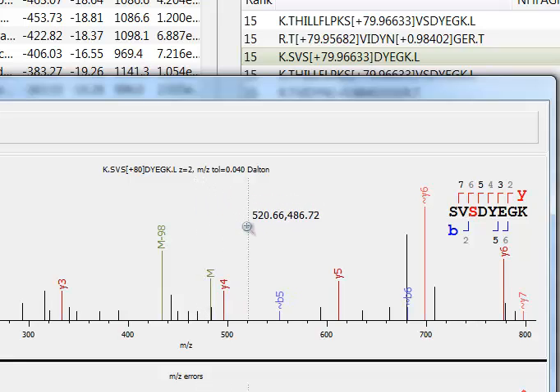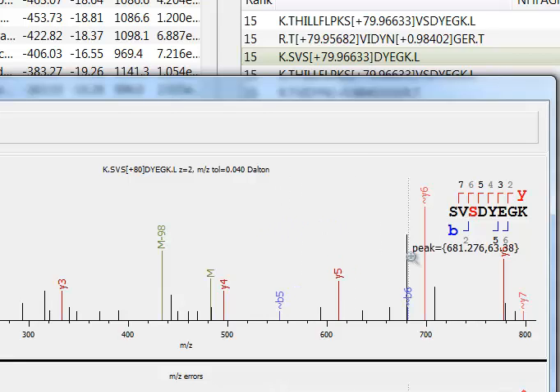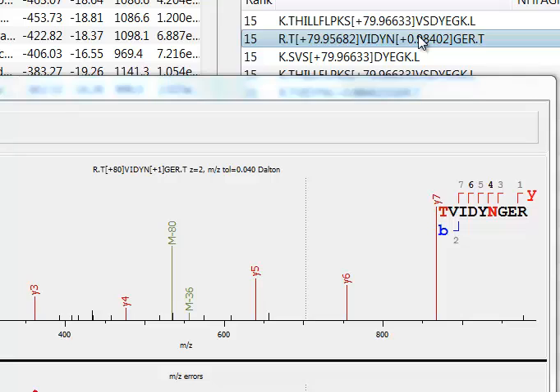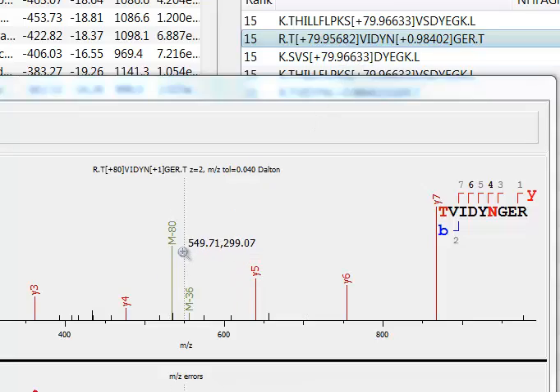Byonic also annotates fragment peaks with the neutral loss. Here we see Y6 — the ordinary Y6 ion with phosphate on — and we see tilde-Y6, which is the Y6 ion with the minus 98 neutral loss. Now let's go to the next identification. This is a sulfopeptide identification: 79.956 is sulfo, and we see here a characteristic neutral loss of 80 Daltons.